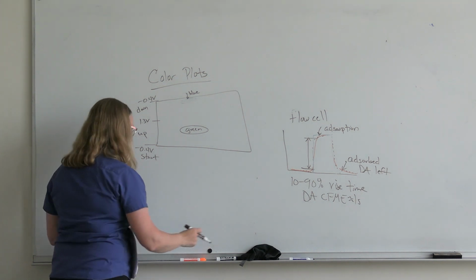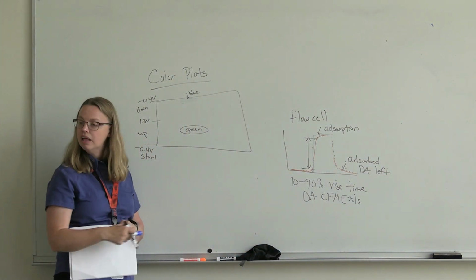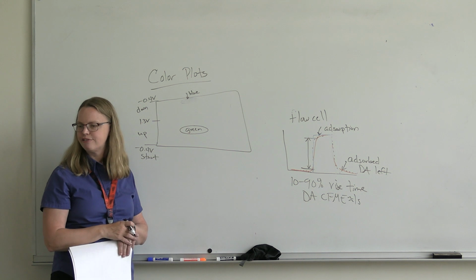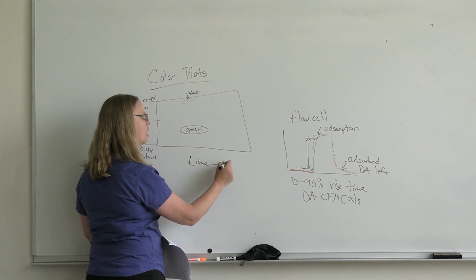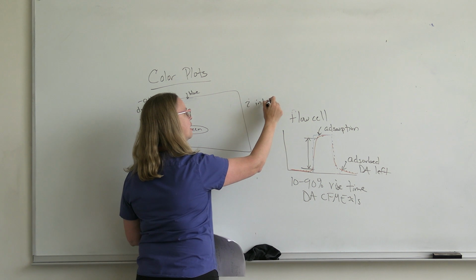reduction. These colors were designed by Mark Whiteman, who is colorblind, and he said he could actually see them. There are a lot of other colors he could not see. Whether he could see true green and true blue, I don't know, but he could see the difference in the colors. So this then is time on the x-axis, and then current intensity.